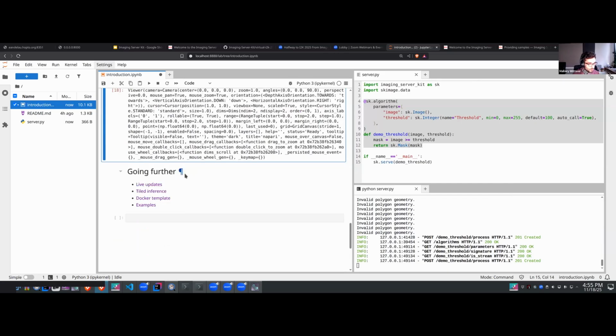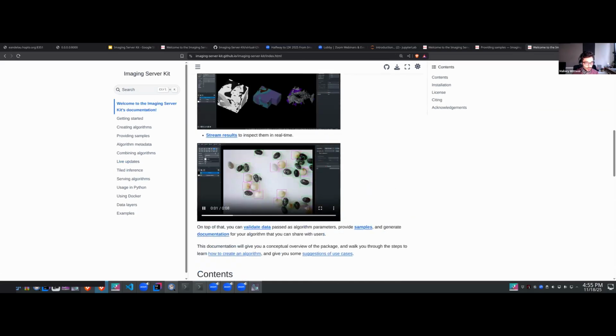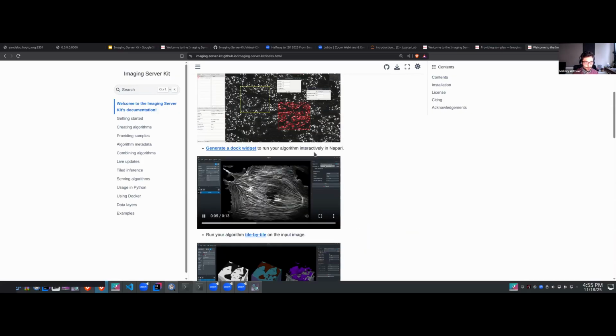Okay, 5 minutes left. I can talk a little bit about going further, what I recommend checking out if you want to dive deeper into the library, and then we will conclude. So there is a concept of live updates. This is what I was very briefly showing you with the YOLO example, where I stream data from the camera into Napari. So that is possible.